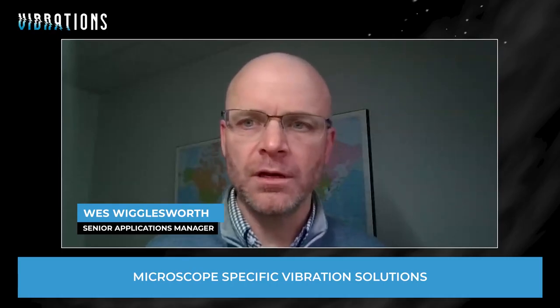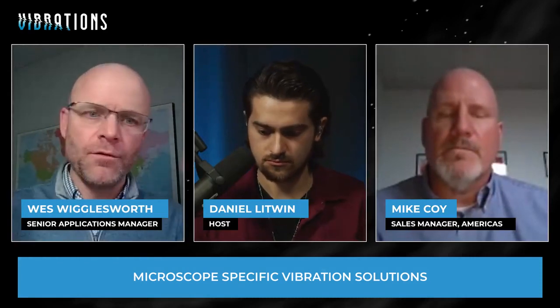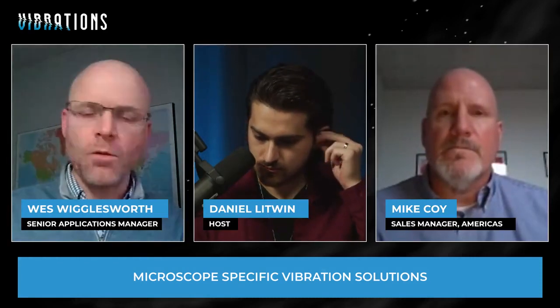Yeah, a little bit, Daniel. It's an interesting question. The automated tools are often used in semiconductor environments, in clean rooms, and the loading of the instrument is automated by overhead transfer systems and robots.